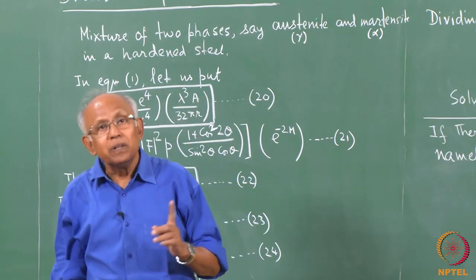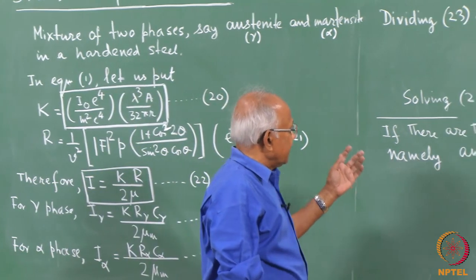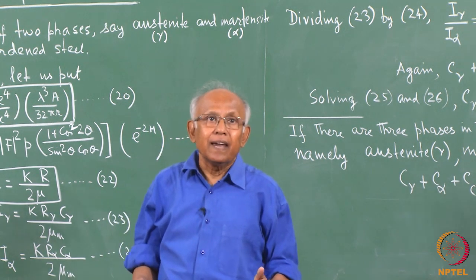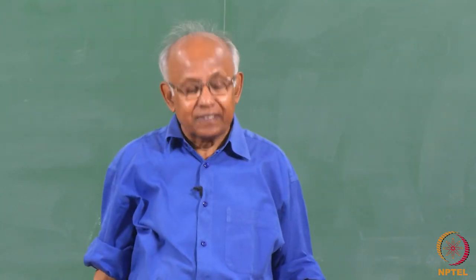Now, I will illustrate the use of the direct comparison method taking a practical example. Let us consider a high carbon steel sample.